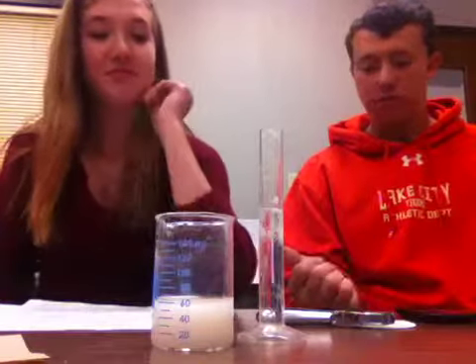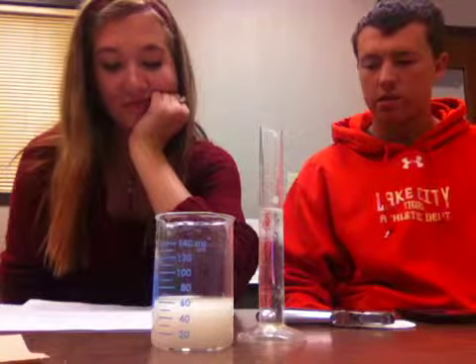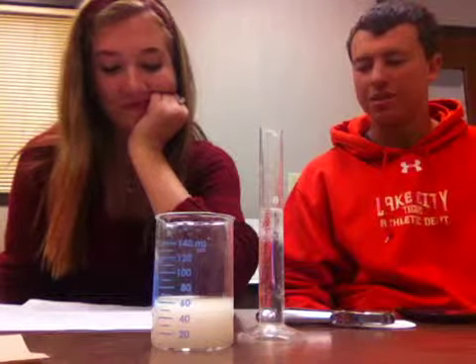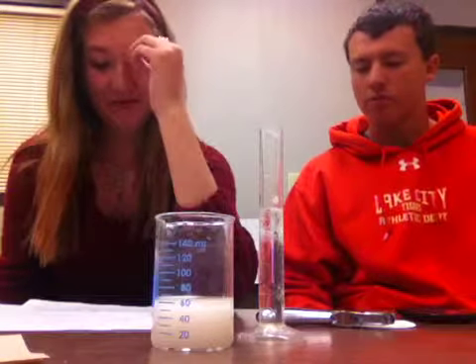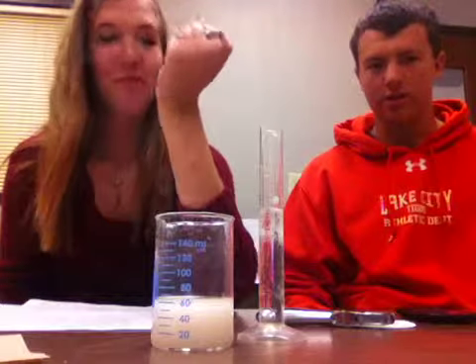That trial took 6.8 seconds, which is different from 6.3 seconds, and that is different from the rest of the results. So that's going to be one of our things that we would need to look into and see what we could change.